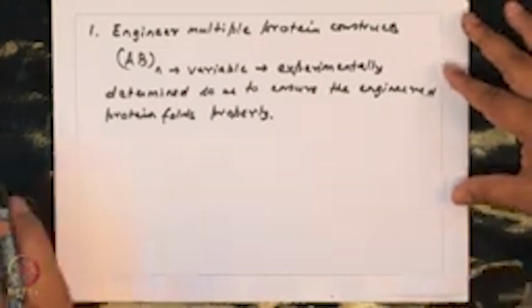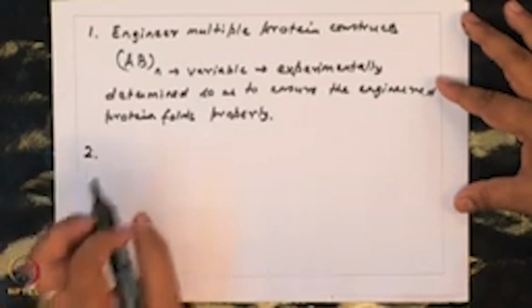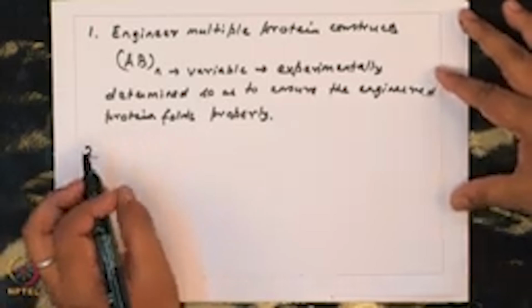By doing this and choosing multiple different constructs, you can determine the folding signature of multiple domains.